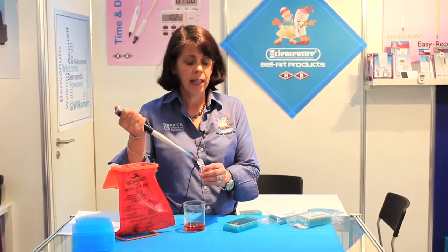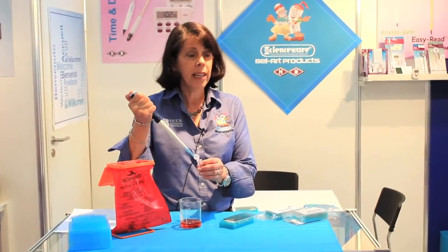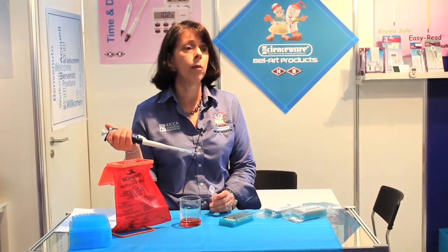Complete test data along with more information about FlowMe and a request form to order your sample FlowMe tray can be found on our microsite, bellart.com/FlowMe. We hope you'll request a sample and get the conversation flowing with your laboratory colleagues. Thank you.